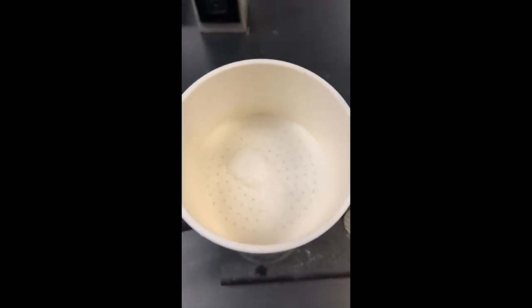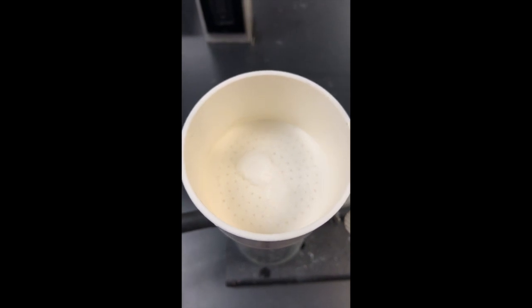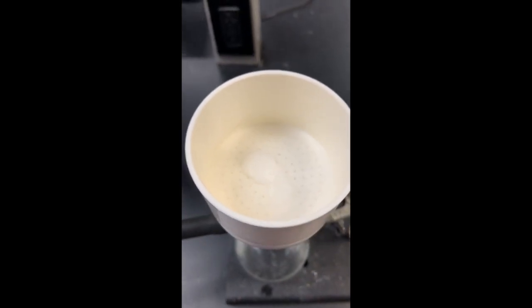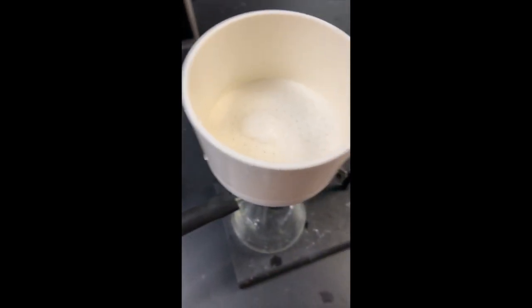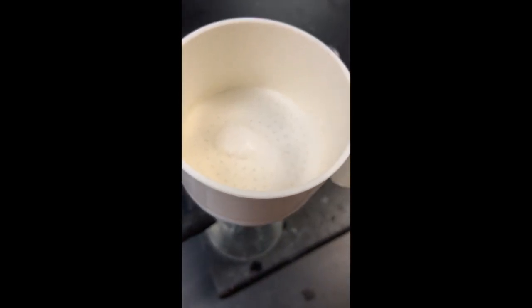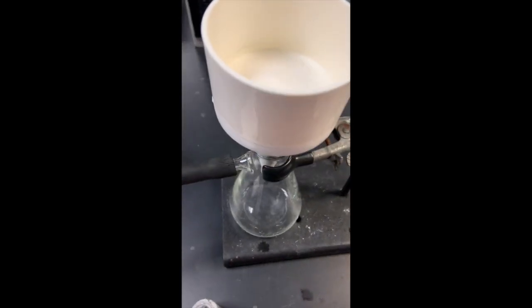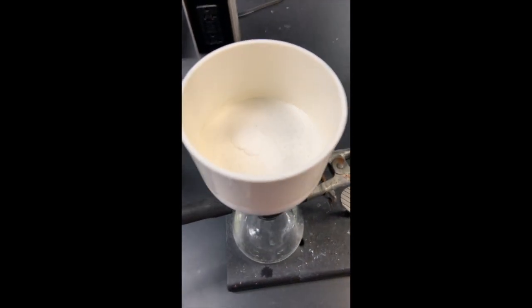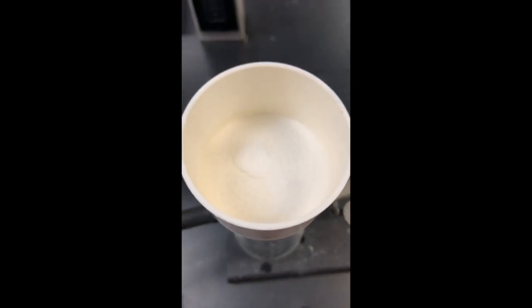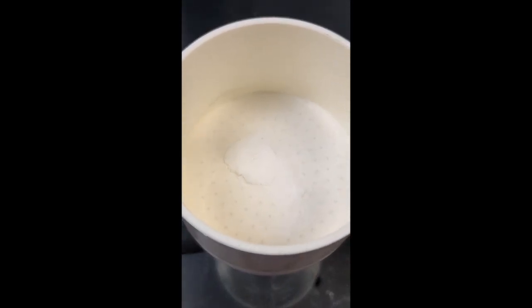I just emptied the contents of the vial into my funnel, and now I'm going to turn on the vacuum and get the airflow moving. Okay, so we see some of that liquid being extracted there, and you already see it drying out quite a bit. There we go, that's a good picture.